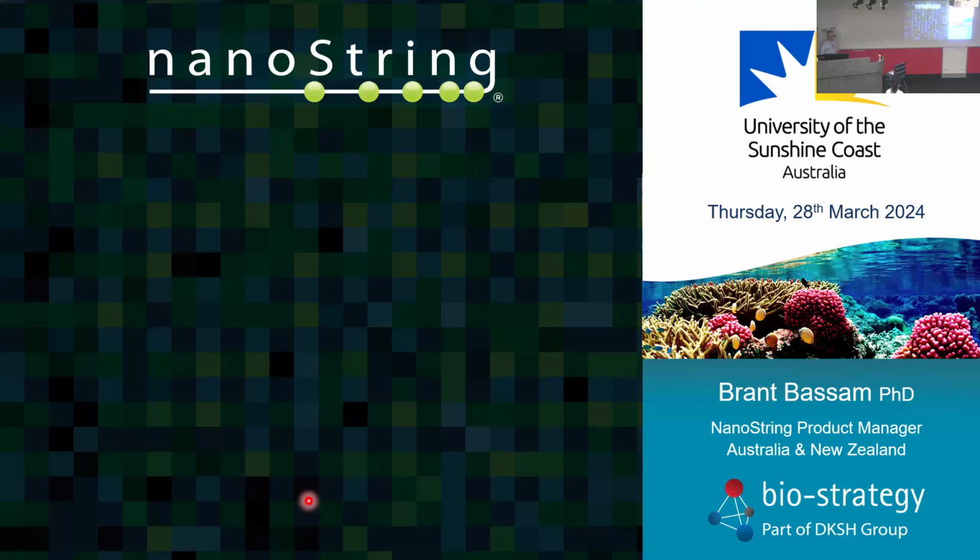Okay, they're really good questions. I kind of anticipated that actually. So where do I start? This is the real question: can we afford to use this thing? I'm actually a fan of digital PCR. Every technology has its sweet spot. Sometimes you really do want to know if you could find that one molecule, so you really do need that level of amplification and sensitivity. And that's where digital PCR is great, not the droplet thing, you don't need that anymore.